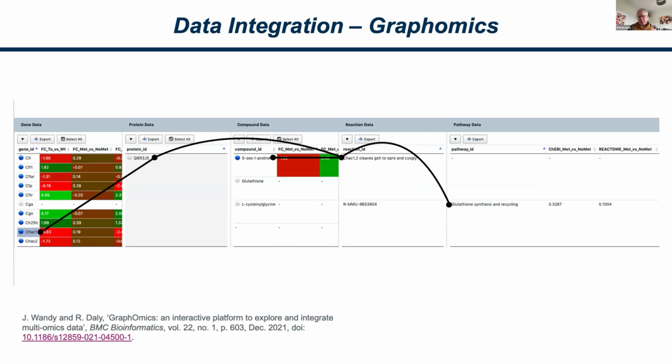It's underpinned by a Reactome database, which models these connections via reactions, and these reactions are grouped into pathways. By doing so, we can get a sense of if something is changing at one level, how it is affecting other things that are changing at a different level. And we get a much better picture of how our data is looking overall in an integrative manner.